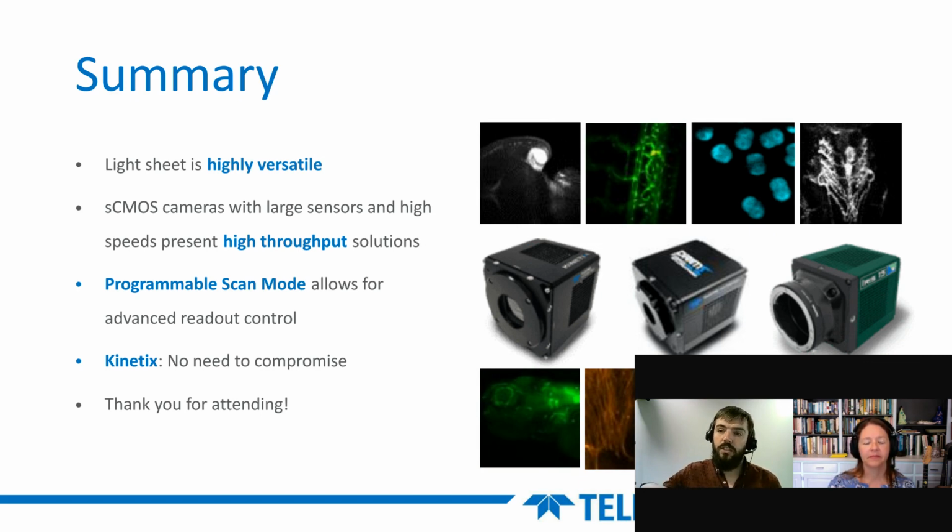But with light sheet, sometimes you want to look at things that are very low magnification so you can fit more onto your field of view. This is why something like the Iris 15 has a smaller pixel of around 4 microns, because this will match up nicely to 20x or 40x, and you get that combination of low magnification but high resolution, so you can image these larger samples.